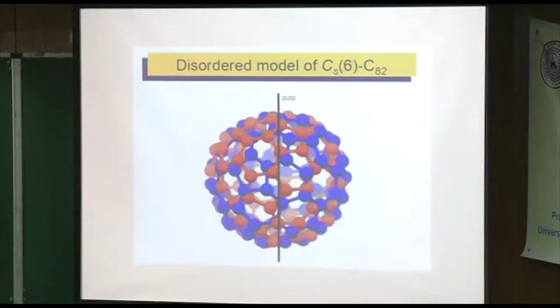You put them together. He's color-coded it, so you can kind of see the blue and the red are the two different orientations superimposed. But until you sort them out and figure out which color belongs to which ball, you're looking at a real mess. It's a challenge. So how do you do this?